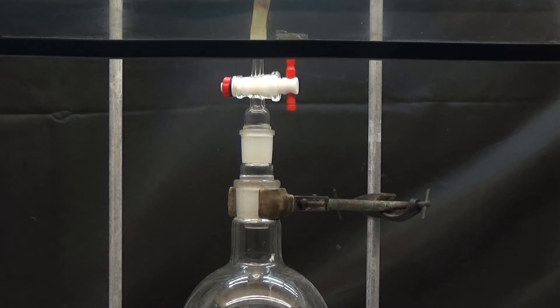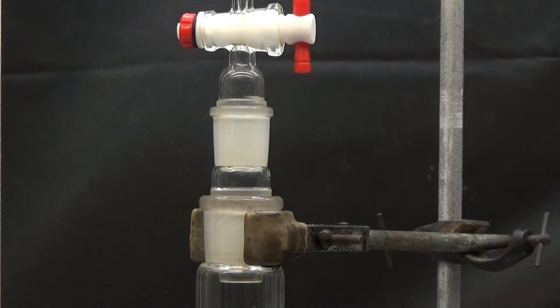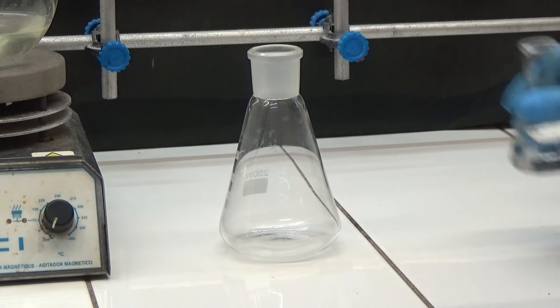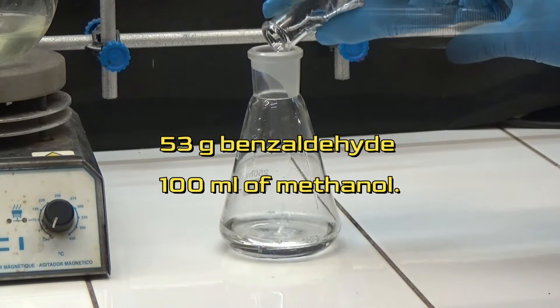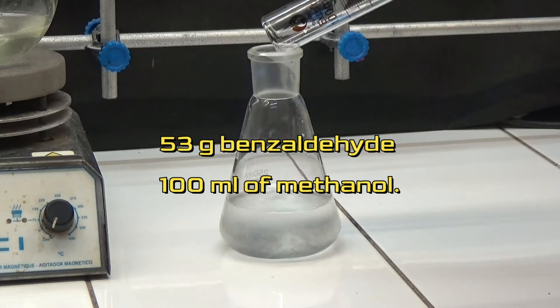At the outlet of the flask, we have adapted a direct outlet tube for fume extraction. In a 250 milliliters Erlenmeyer flask, we prepare a solution of 53 grams of benzaldehyde and 100 milliliters of methanol.